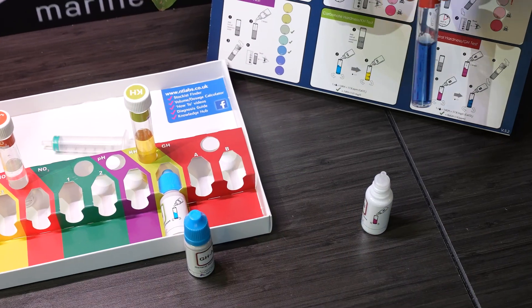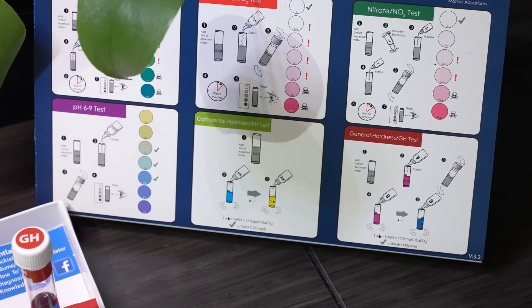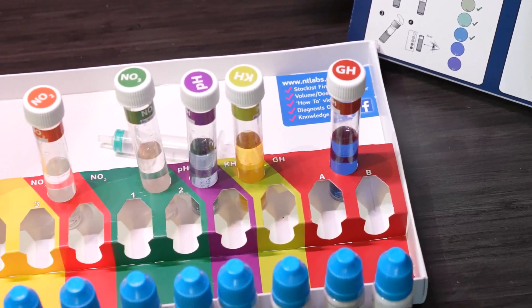I love this test because I can trust that I'm getting an accurate reading every time. Considering that this kit guarantees nearly 200 uses, this is an offensively affordable tool to add to your arsenal.